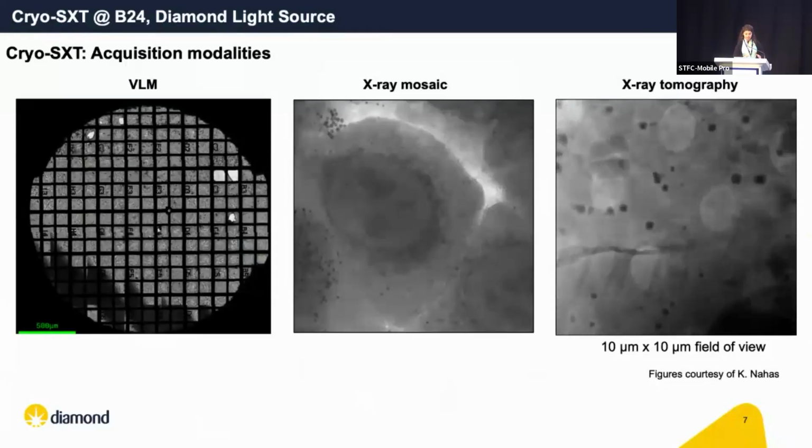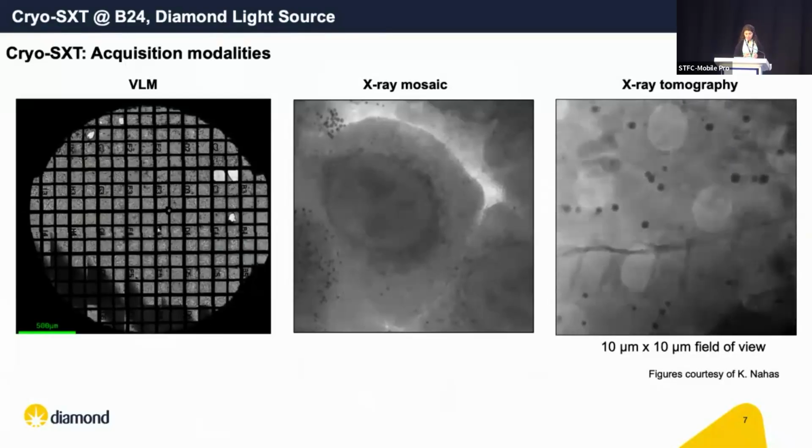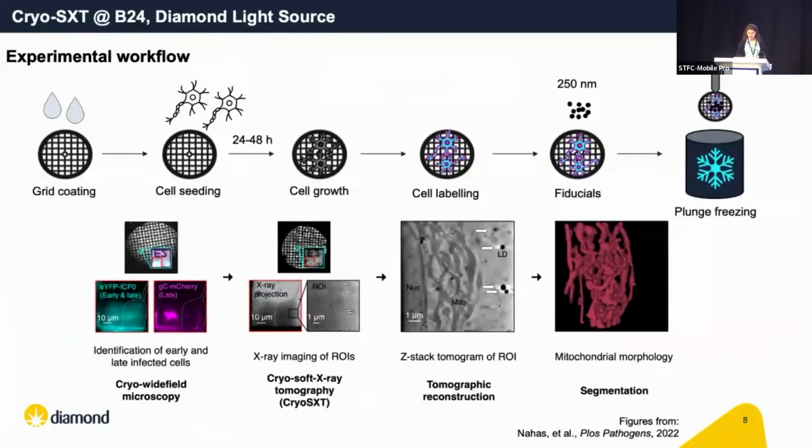After we have an atlas, we can select areas that are of interest for our analysis, and within those areas, we can select a region of interest where to collect our tomographic data. So we provide projection in the first place, and then through an automatic pipeline of reconstruction, we also provide the reconstructed stack to users directly on the fly on the Beamline.